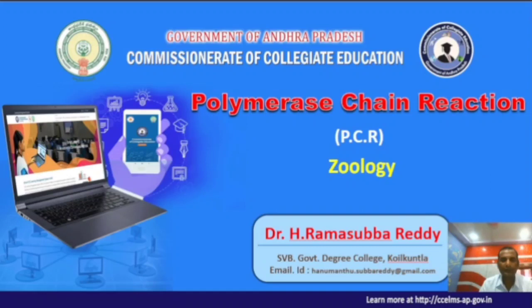Today, our topic is basics of polymerase chain reaction. Polymerase chain reaction is also called simply PCR. This test is also called molecular photocopying method. This polymerase chain reaction is very essential to synthesize more copies of DNA.